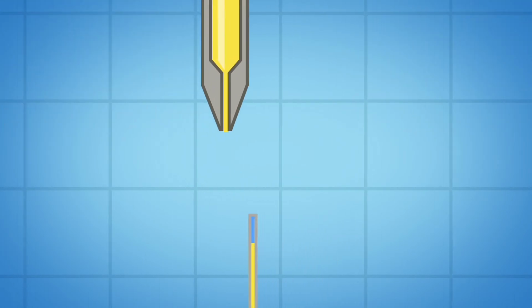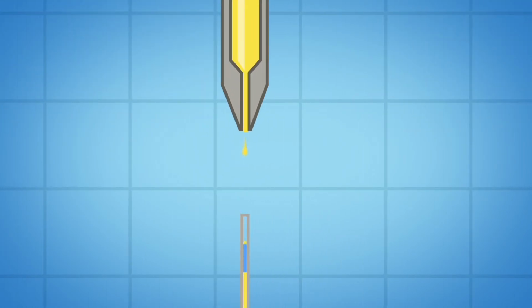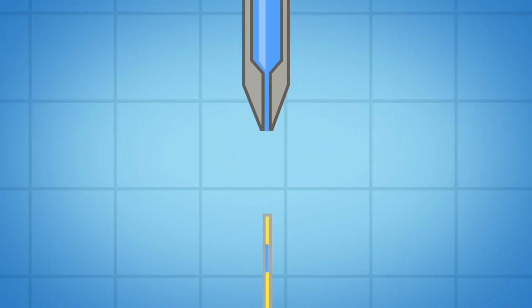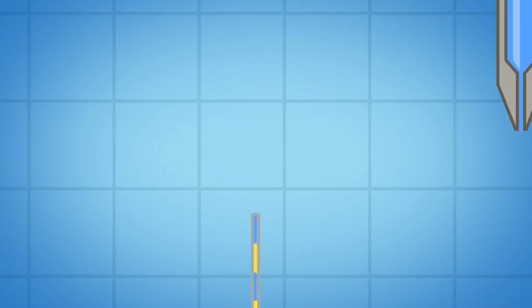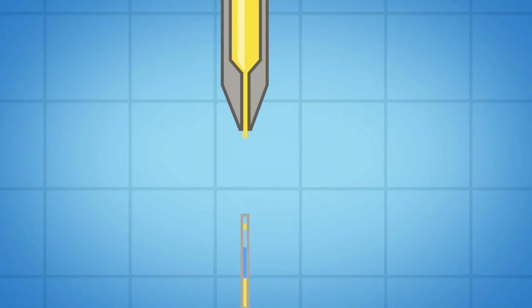When the sample is completely ejected and evaporated into the collector tube, droplets of oil are ejected from the distal end of the collector tube, making room at the top of the collector tube for the next sample. The volume ejected is the volume required to contain the oil spacer used to separate each concentrated sample plus the concentrated volume.